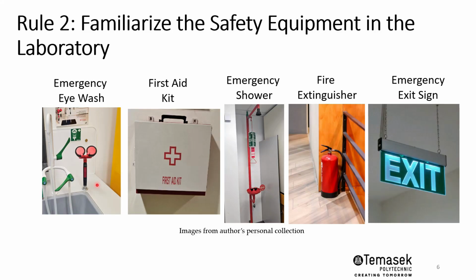Typically this will be next to a sink, and then the individual will have to flush his or her eyes for at least 15 minutes, just to get rid of any solution that has gone into the eye. The first aid kit contains your necessary materials, bandages, safety pins, as well as your plasters, so you can cover up any of your open wounds with the materials from the first aid kit.